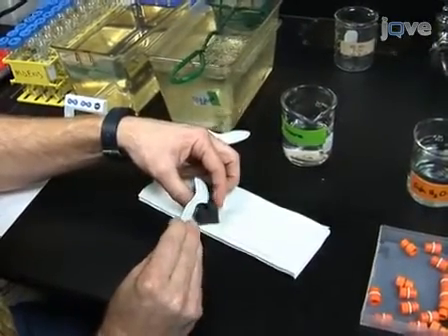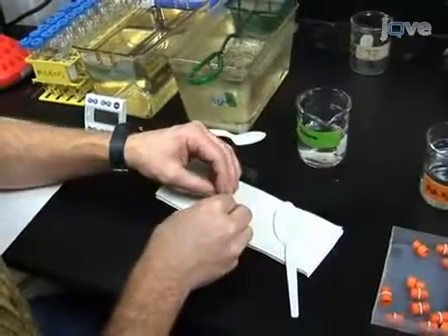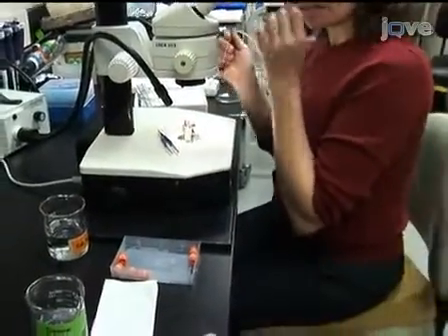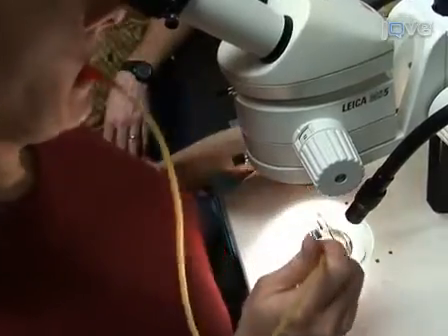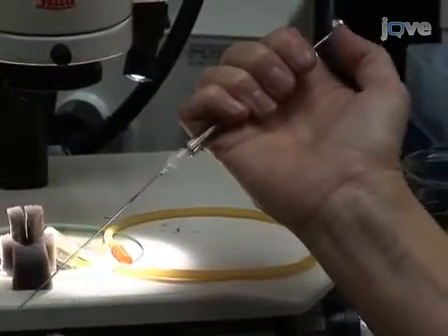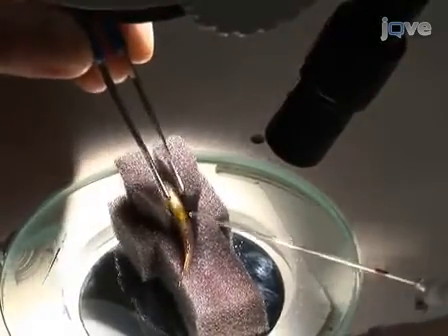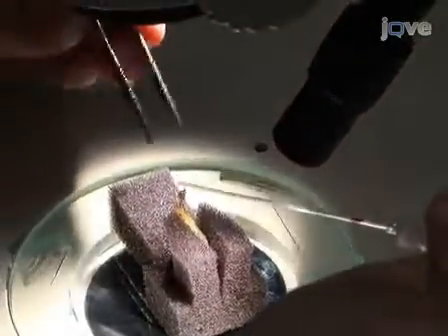Position the fish on the sponge holder, ventral side up. If the region around the pelvic fins is still moist, gently dry it with a kim wipe. Place the marked capillary tube in a rubber mouth pipette adapter that is included with the capillary tubes. The adapter is a rubber hose that has a mouthpiece on one end and a capillary holder on the other. Alternatively, the capillary tube can be connected to a 50 microliter Hamilton syringe using a short piece of Tigon tubing of the appropriate diameter. Place the male under the scope and expose the urogenital opening by carefully spreading the pelvic fins apart using the end of the capillary tube.